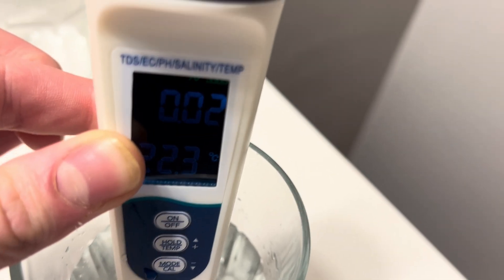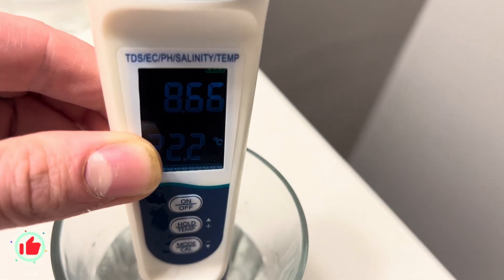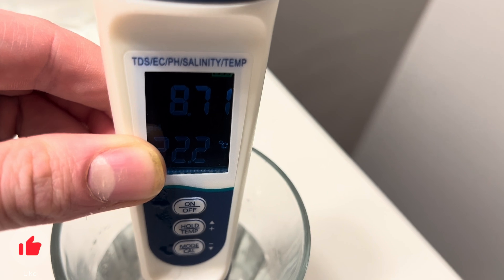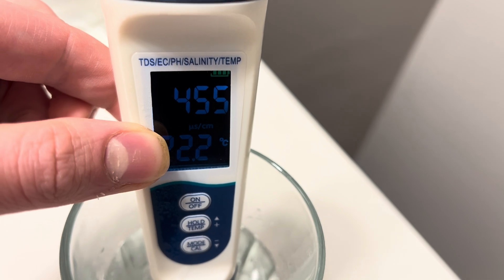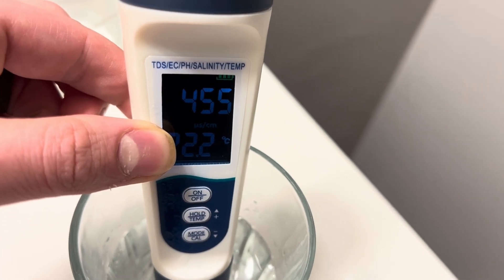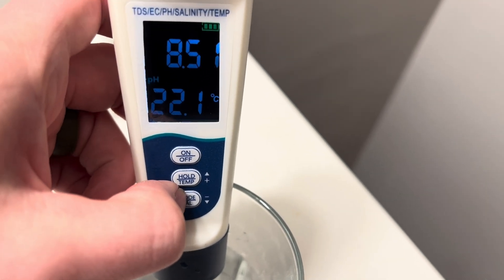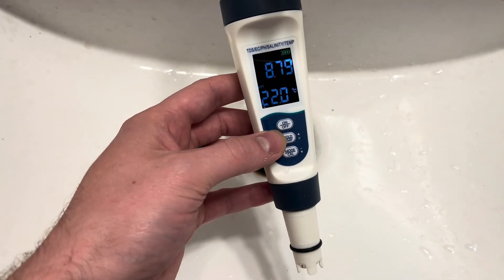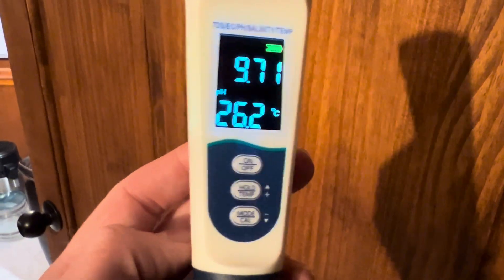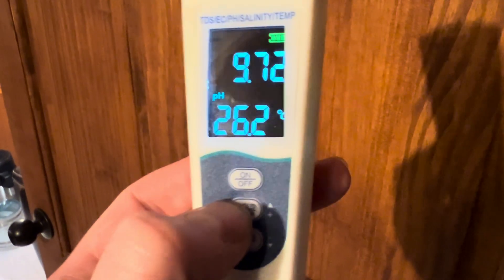With this being tap water, of course there's not really much in it. And then we're back around to pH. It can also measure EC — there's the EC. Now we're going to test the fish tank. And if you want to change the temperature from Celsius to Fahrenheit, you can hold the middle button that says 'hold temp' and it will switch from Celsius over to Fahrenheit.